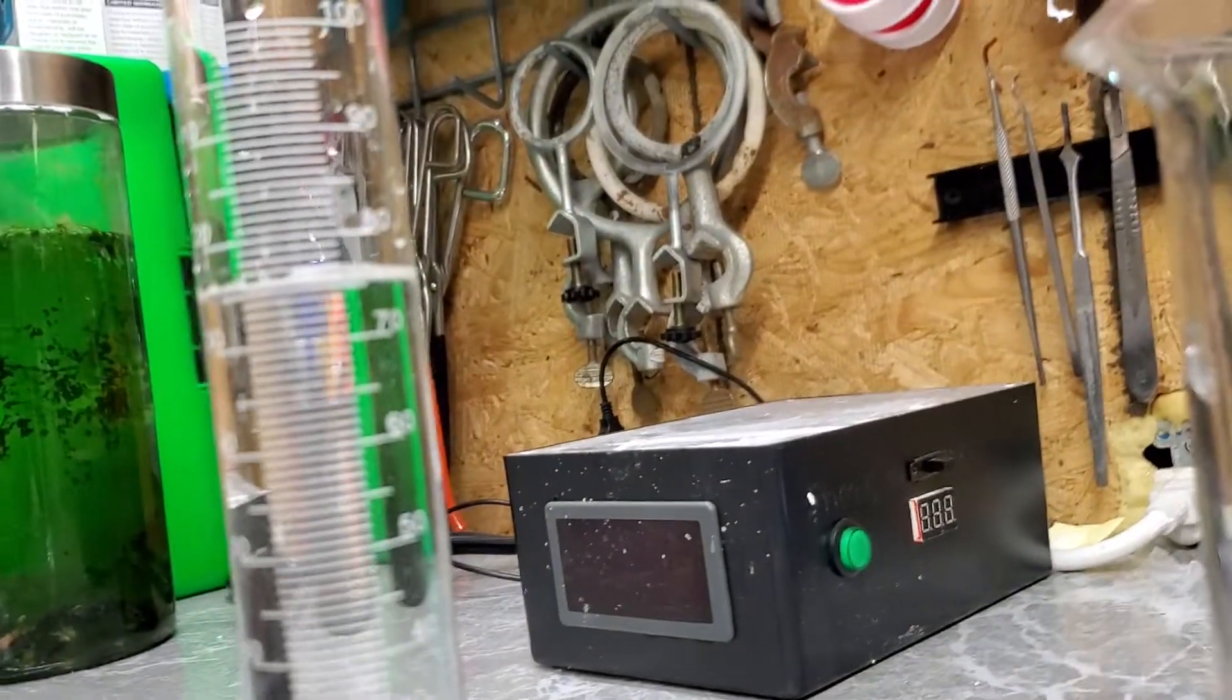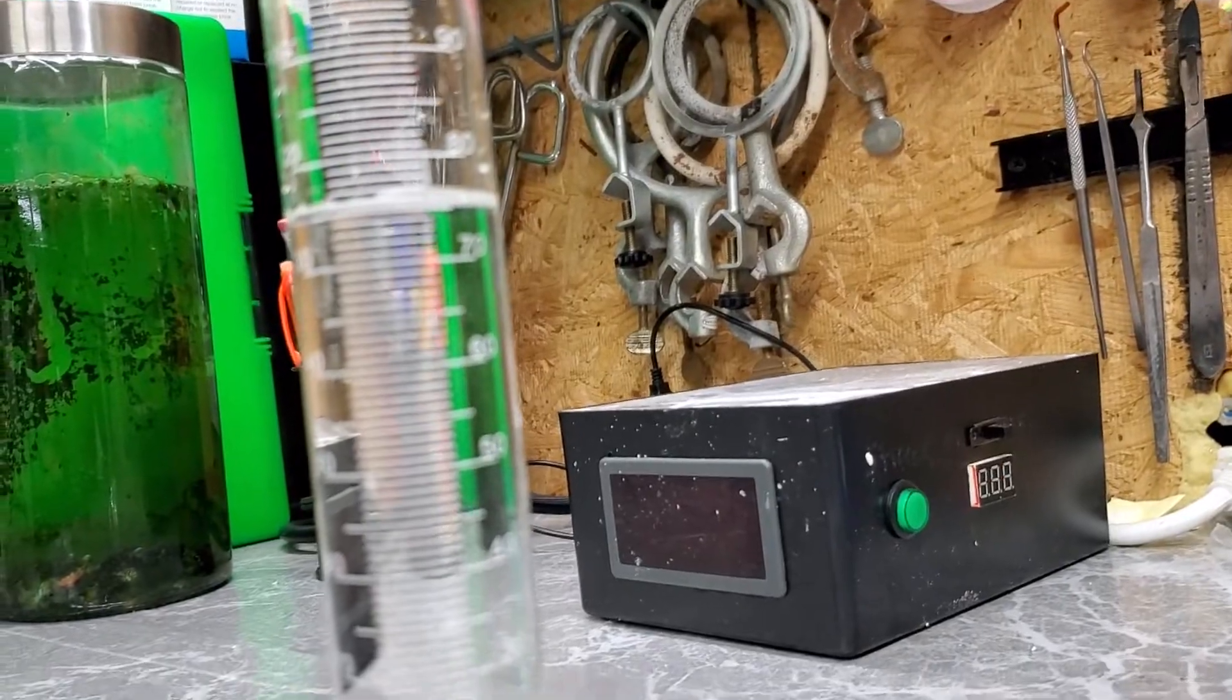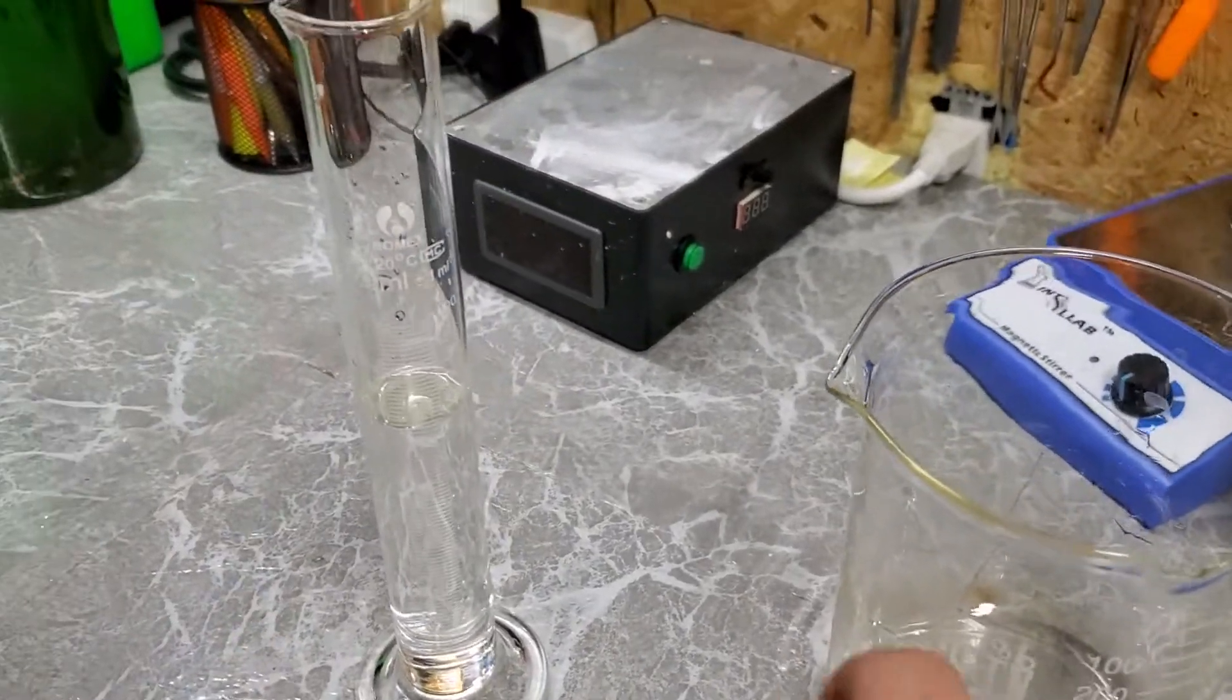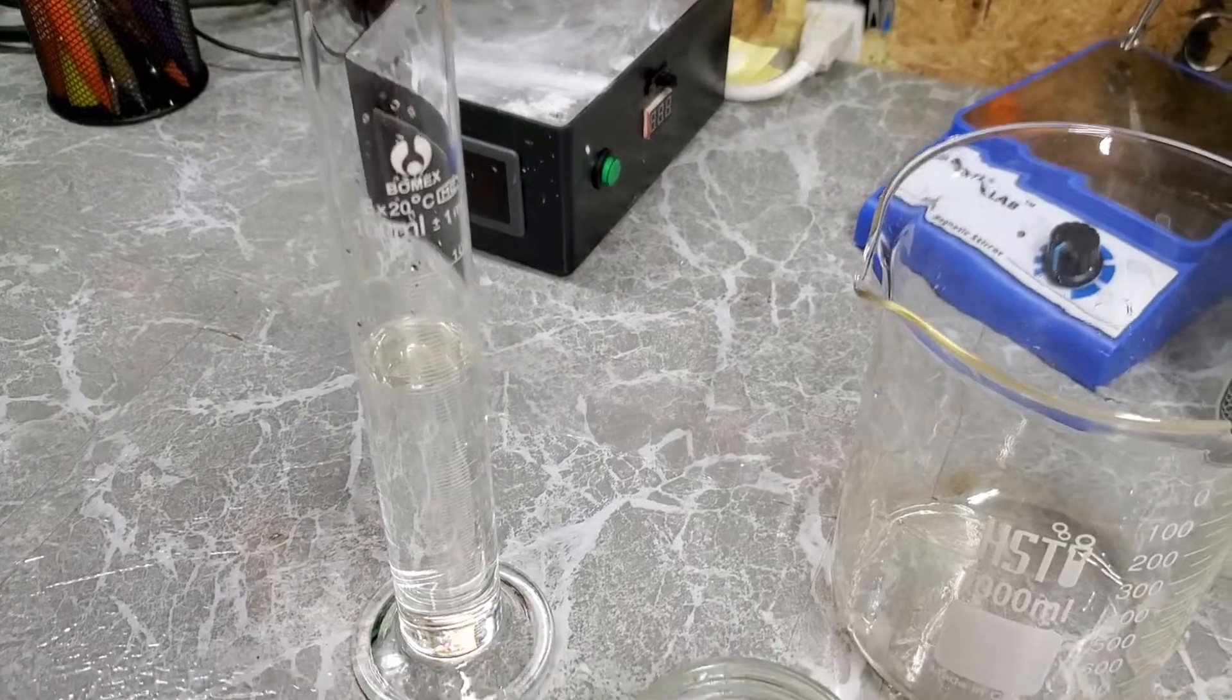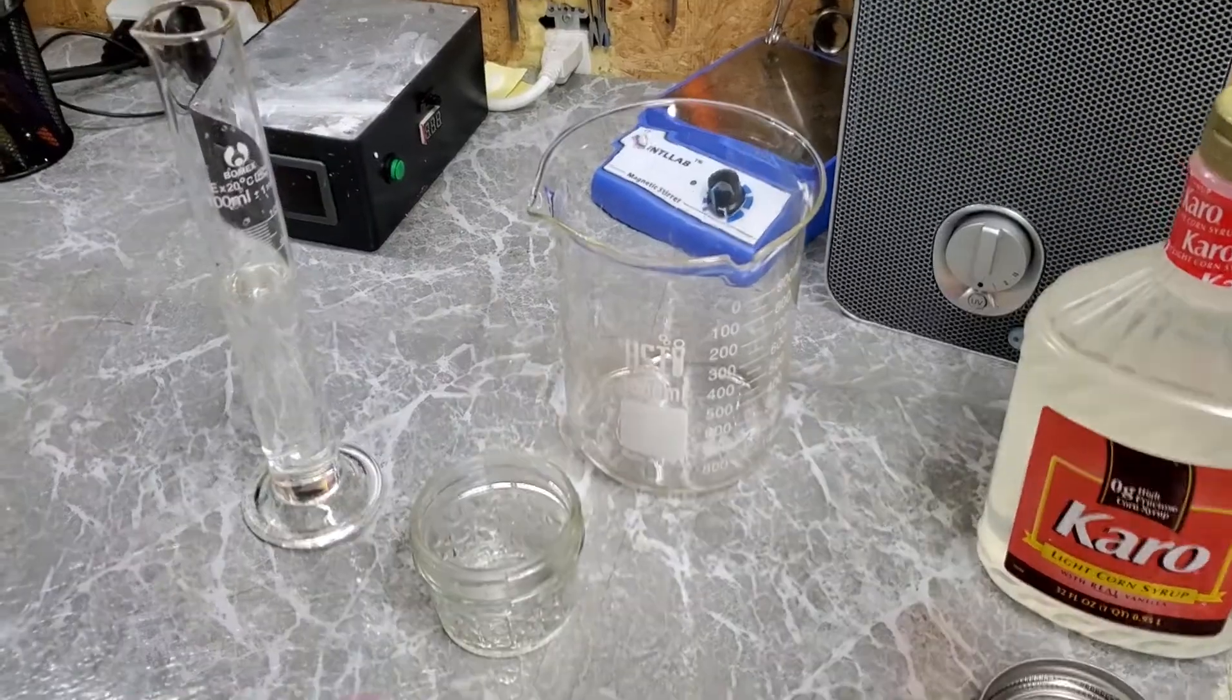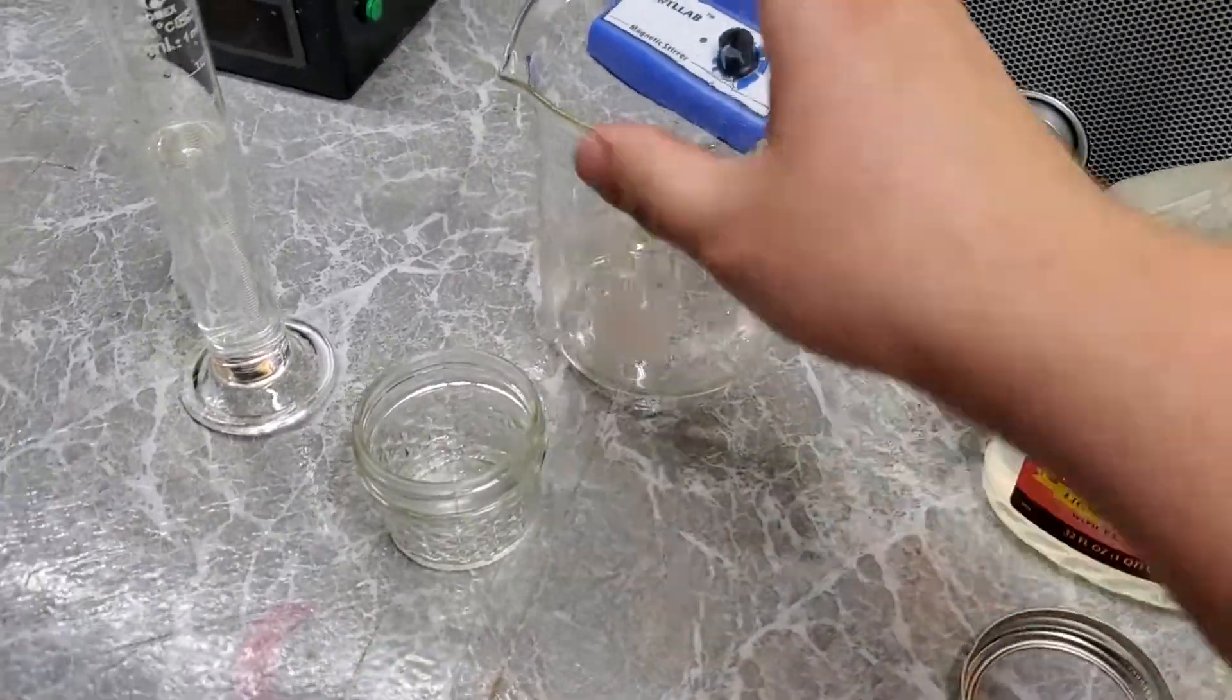So what do we got? About 75 milliliters. So 75 milliliters, I'm going to make nine of these. That means I need 675 milliliters of distilled water.